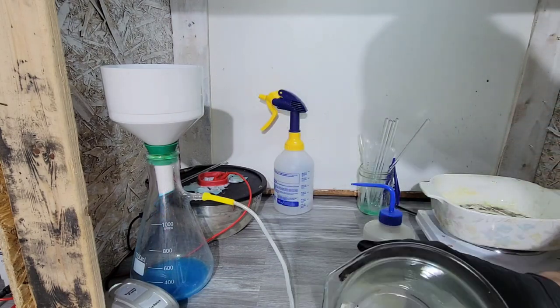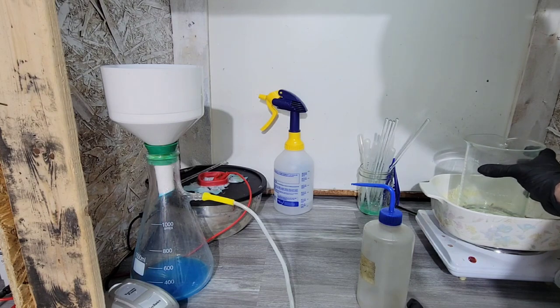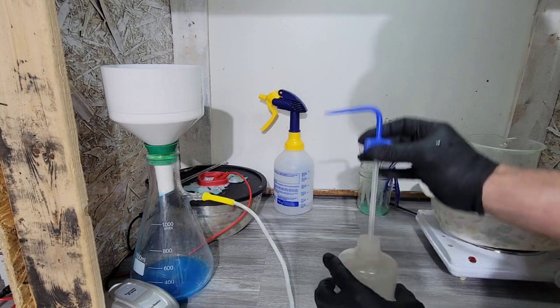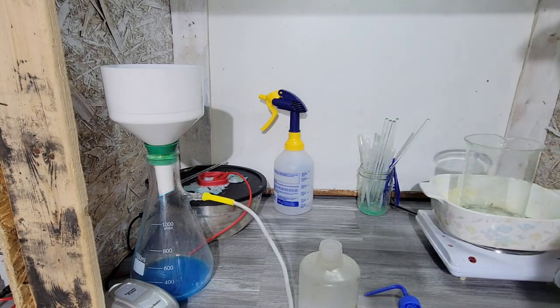Copper in there still left, so I know that all of our nitric was used. So that's good.